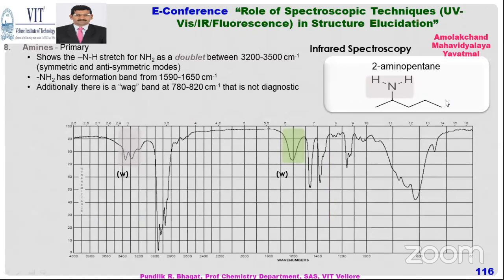And as there is no aromatic region here, you will not find any hump. At the same time, this is less than 3000. That is why I'm saying if your sample is very pure, you will get beautiful spectra. A spectrometer is available in Nagpur. Of course, I don't know about Amravati, but Nagpur is very near, and it is available in the Institute of Science. Another bond is the CN bond, which is weak in nature.